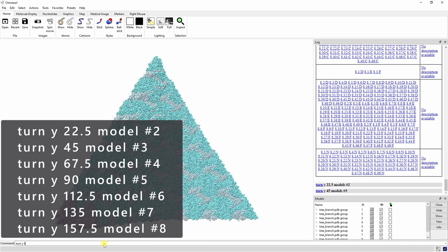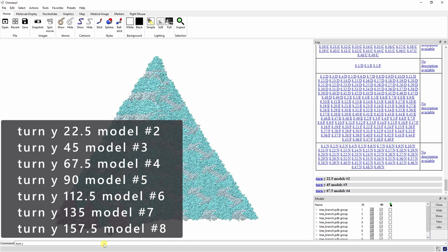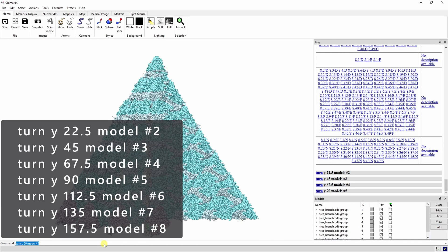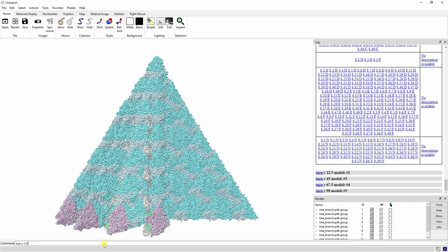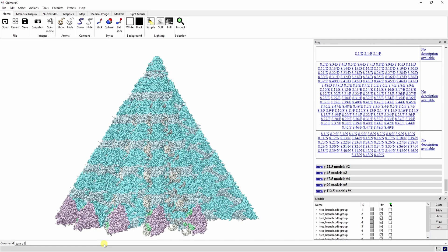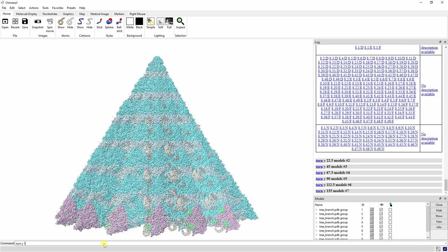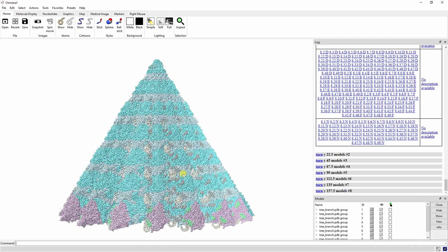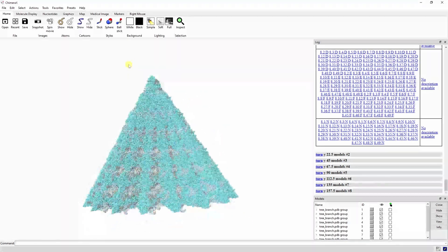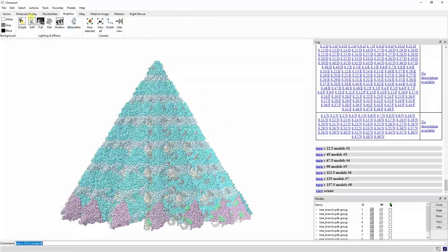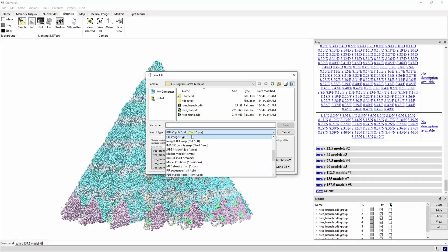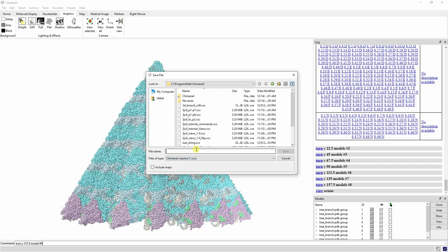We're going to turn these models about the y-axis in increments of 22.5 degrees to make a cone. Once you're finished, you can save this as a session file or a PDB.